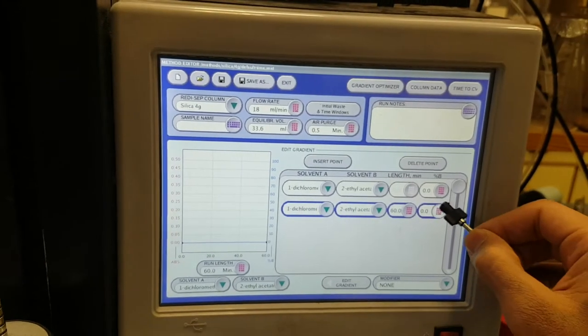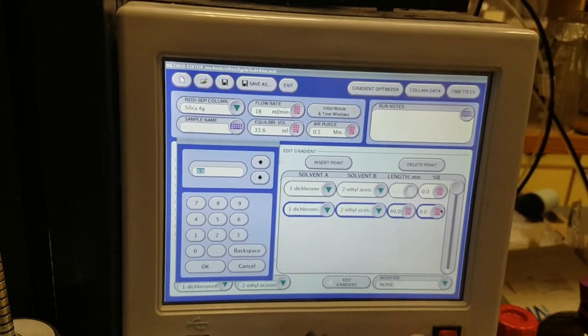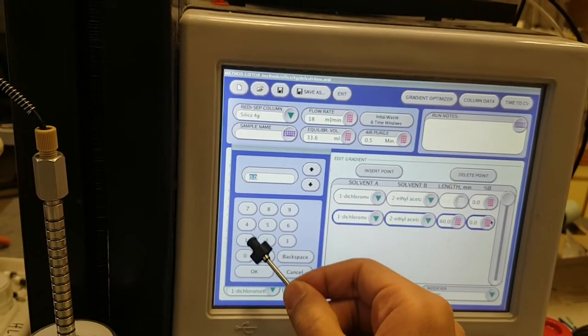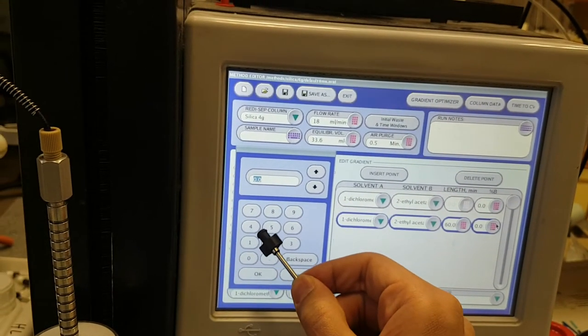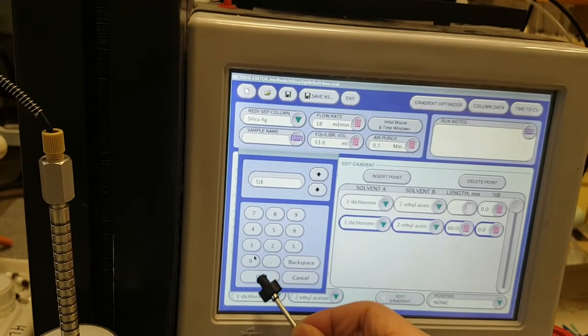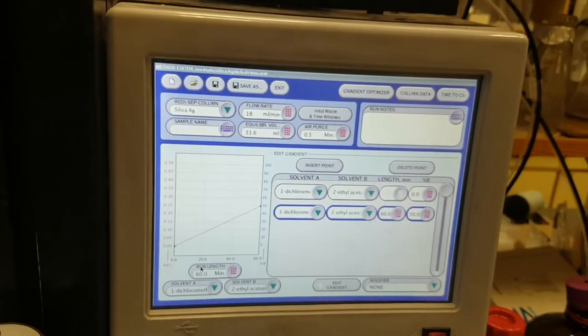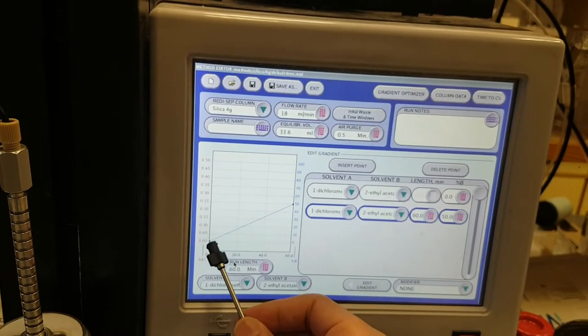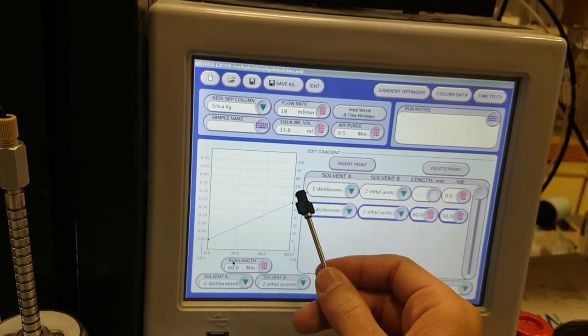I am working with a gradient system. I'll go to 50 during one hour. This is the gradient system. During 60 minutes I'll go from 0 to 50 with the ethyl acetate.